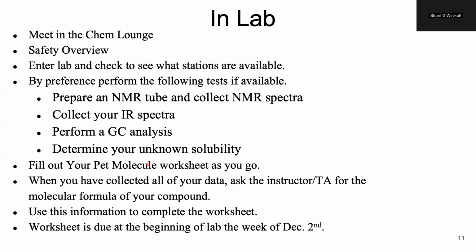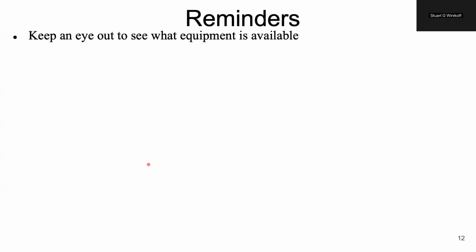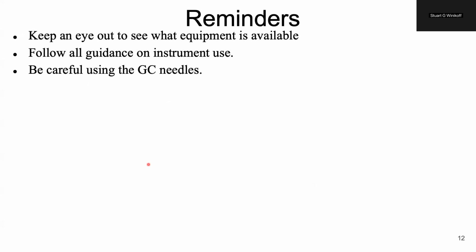Otherwise, it's just due at the beginning of the next lab, which is going to be all the way on the week of December 2nd. So as you're going through, keep an eye out to see what equipment is available. Make sure to follow all guidance on the instrument use. Some of these instruments are very expensive and very finicky. If you have any questions, please check with an instructor or TA before you do anything.